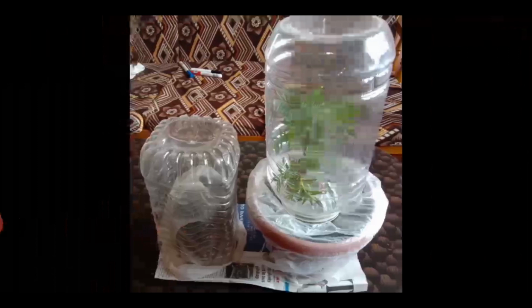Then the third step: you can see the other pot is also being covered there. We take that pot and cover it entirely with a polythene bag, then cover it with a bell jar. This pot acts as a control setup here.